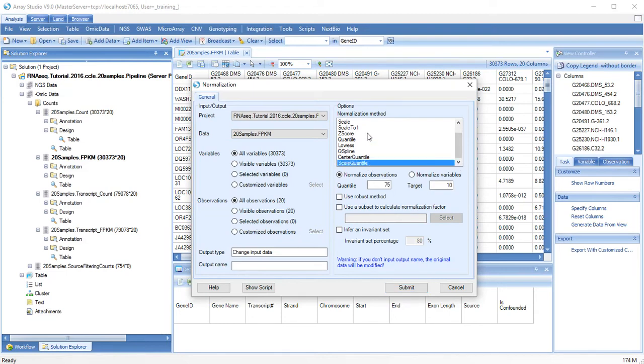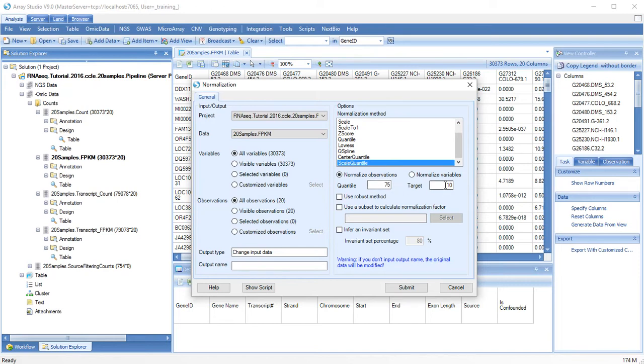Details of additional normalization methods can be found at the Help page. You can also change the quantile and the target expression level.